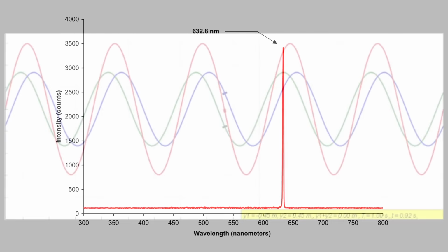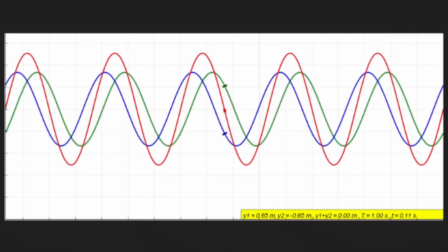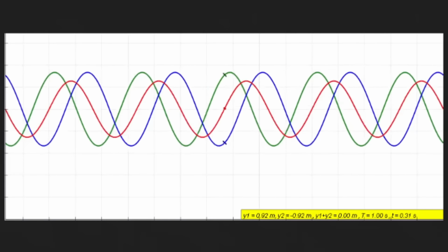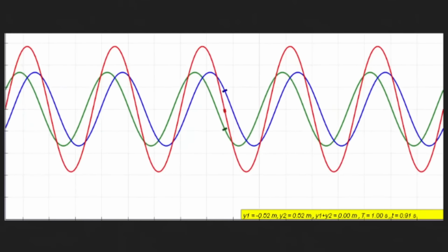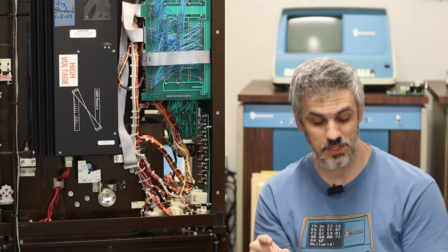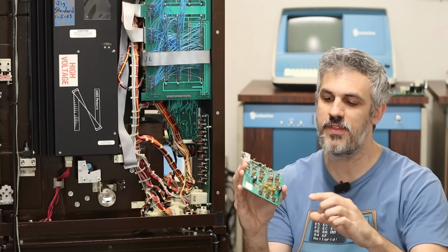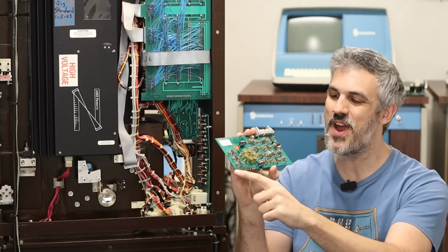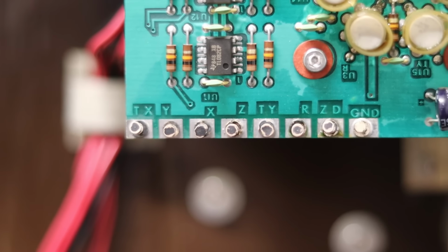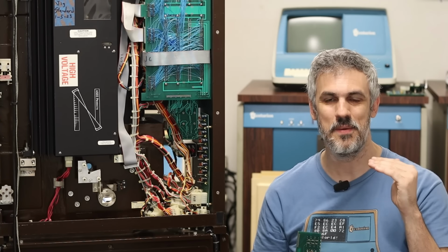And as we're moving the mirror, the beam splitter is going to be splitting that beam and then recombining it. And that laser is going to be moving in and out of phase with itself. And we should be able to see that in and out of phase interference as a sine wave on the oscilloscope, picked up by the sensors on this card, read out, after it goes through a bunch of amplifiers, of the test points here on the bottom. And we should be able to move this thing around until we get absolutely everything aligned perfectly.